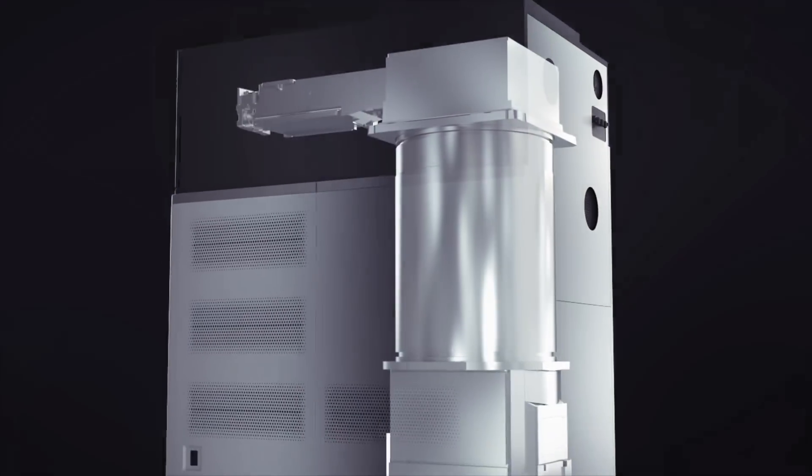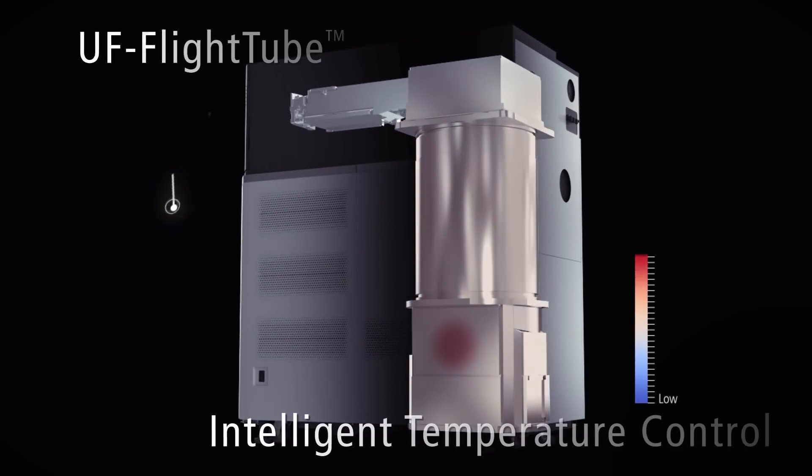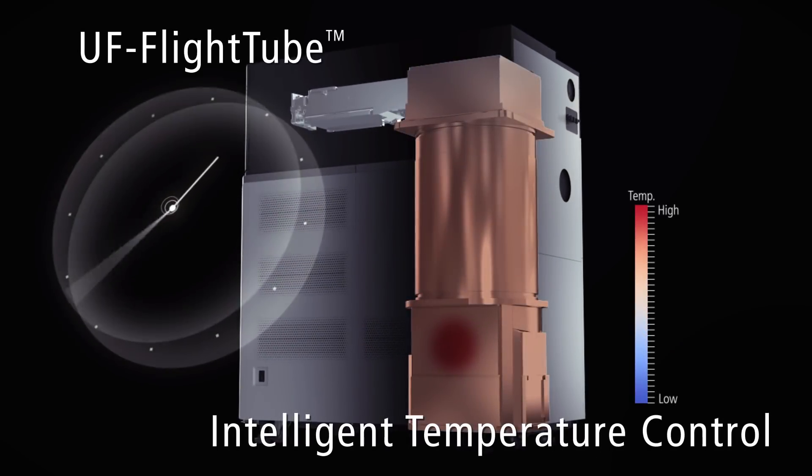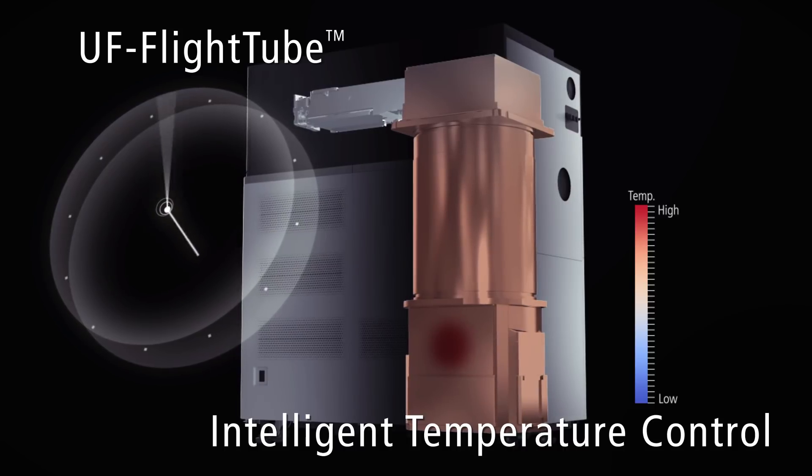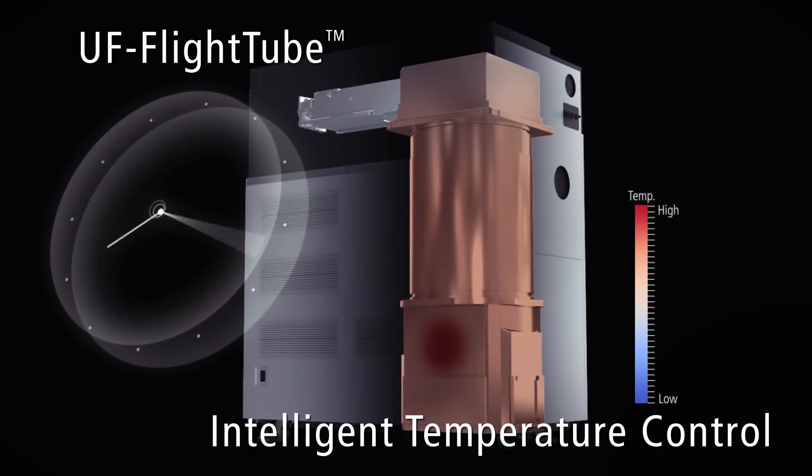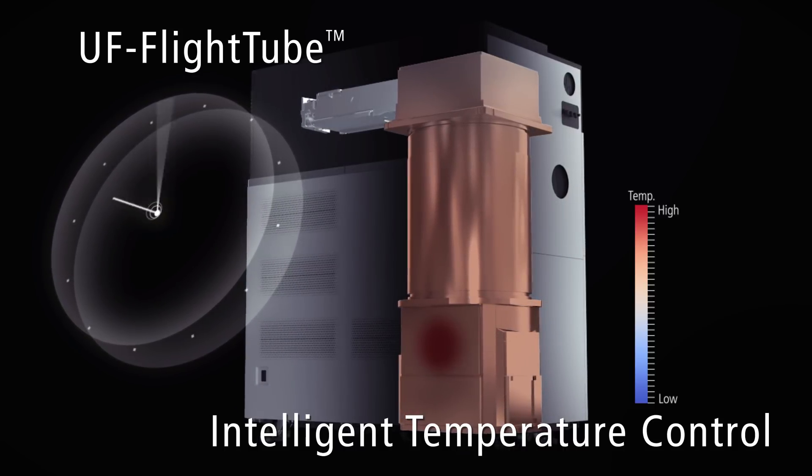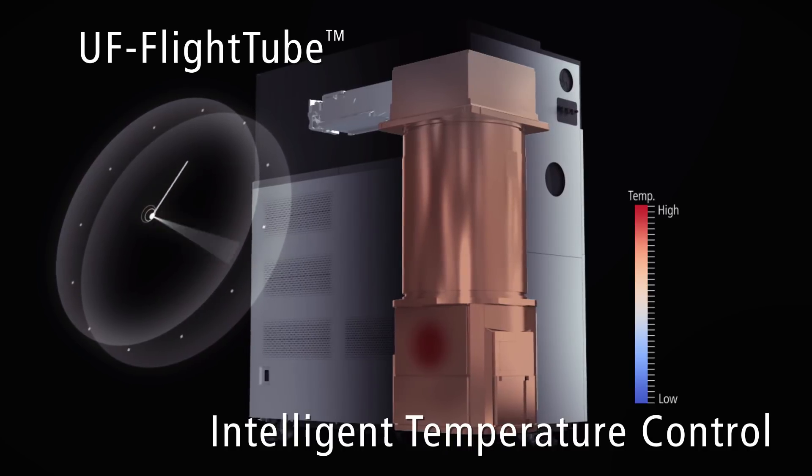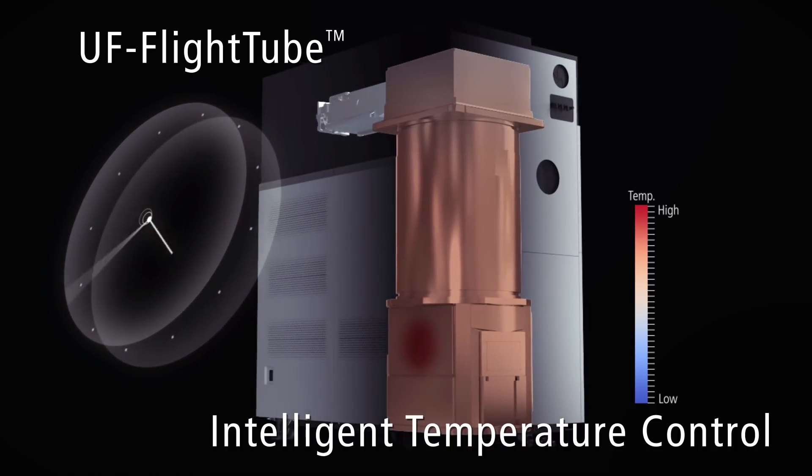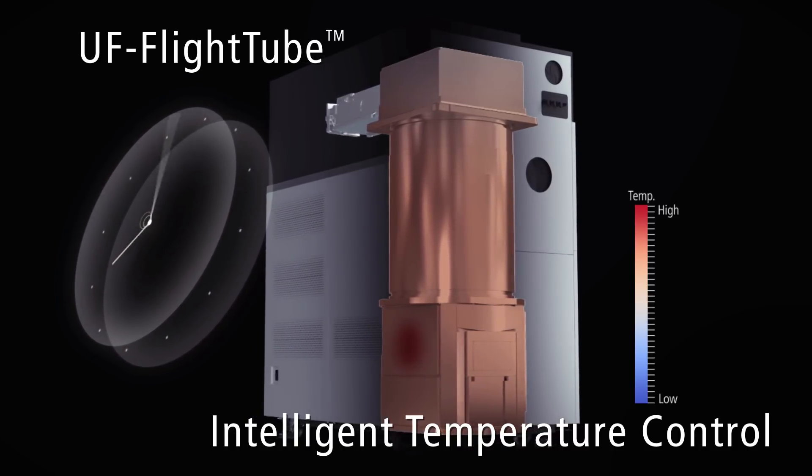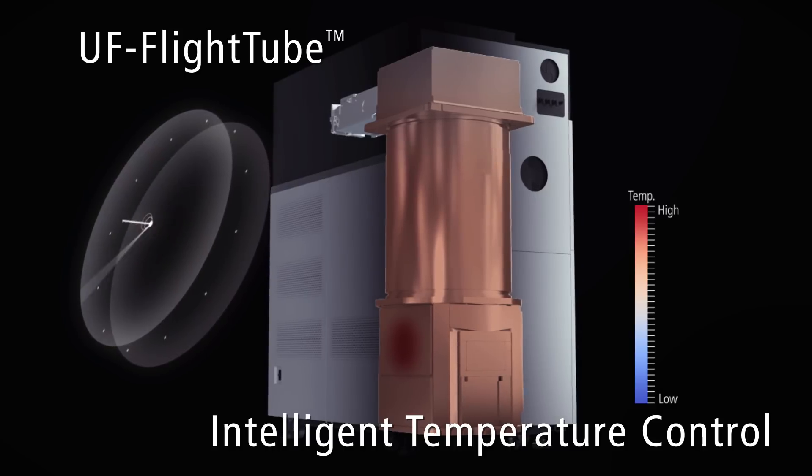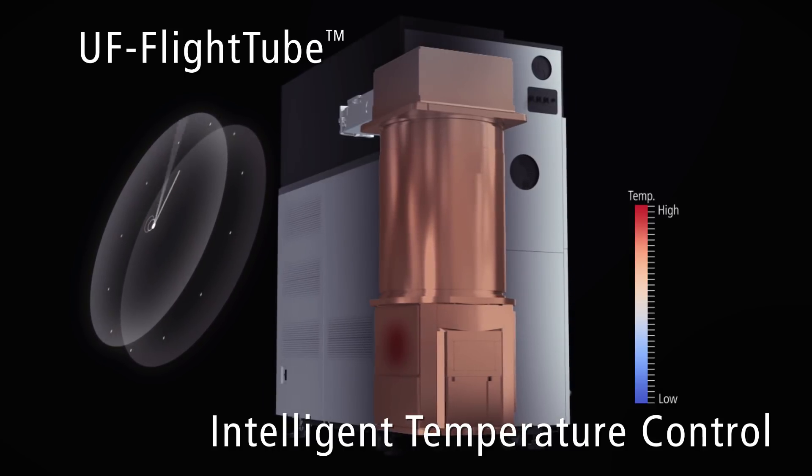Shimazu's unique intelligent temperature control system is a key technology underlying the robust mass accuracy of the LC-MS 9030. A carefully engineered configuration of heater and sensor has been empirically proven to yield the best stability.